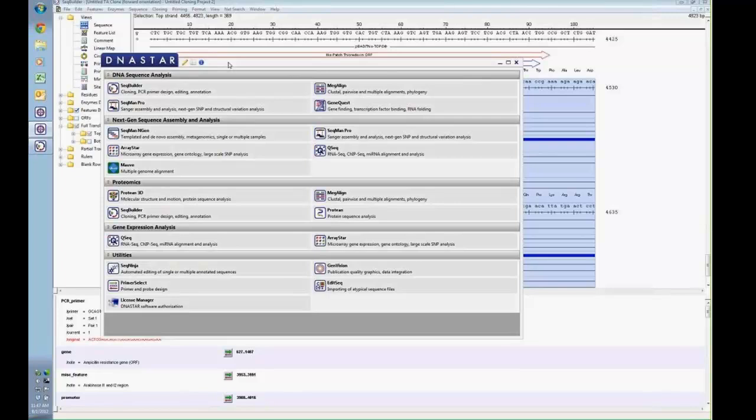When you initially open SeqMan, there's 2 windows. This is called the unassembled sequences window. This is where your contigs that will be aligned to. So you simply go to add sequences. Here's some demo data I previously worked with that's built into the software. This is SNP demo, but for this specific case, it's similar to the experiment that you're trying to do. What I would do is I would simply mark that first, whatever you're listing as the wild type, or if that's the initial plasmid and you want to assemble the sequencing reaction against that plasmid, I would mark that as a ref.